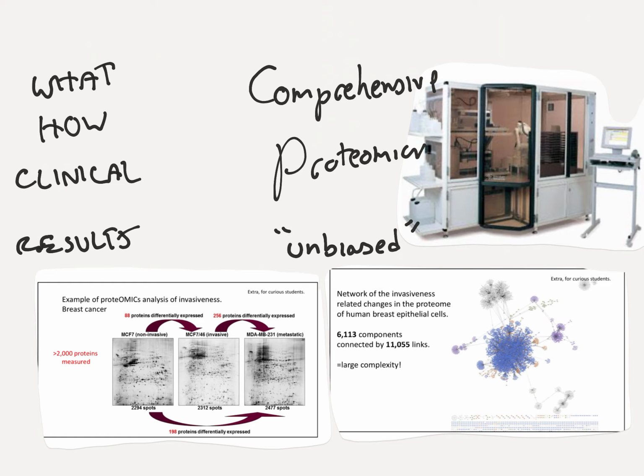All right. Another name for this whole technique is comprehensive proteome profiling. I'm not going to bother writing the entire thing down, but it's just comprehensive proteome profiling. And it can actually work in one of two ways. It either finds proteins by trying to recognize and find certain peptide sequences in the sample.